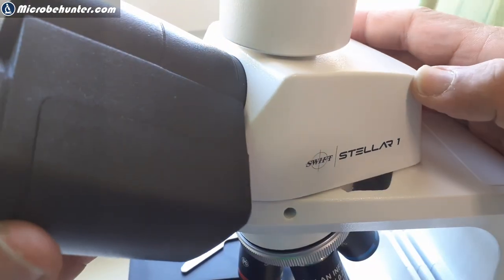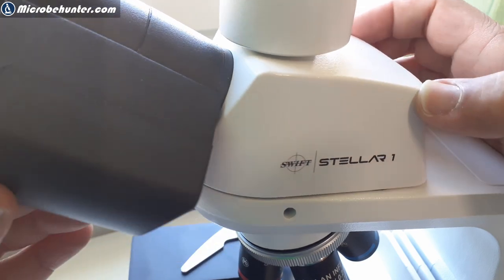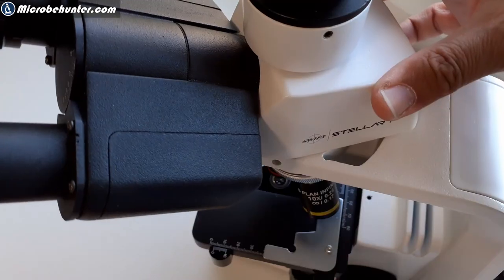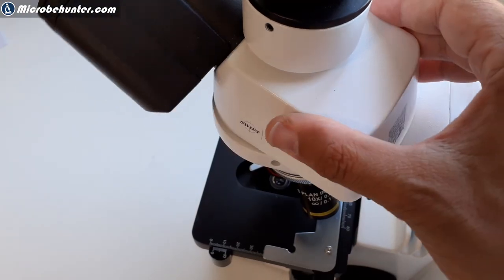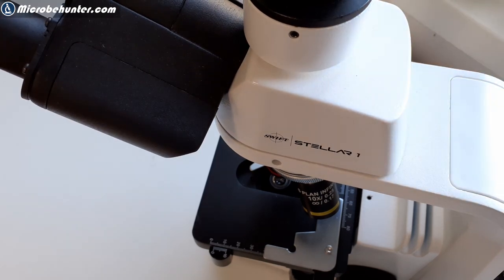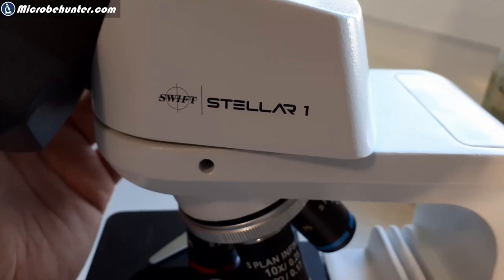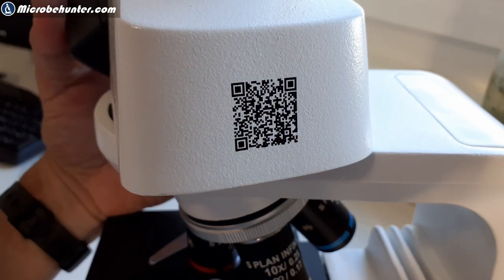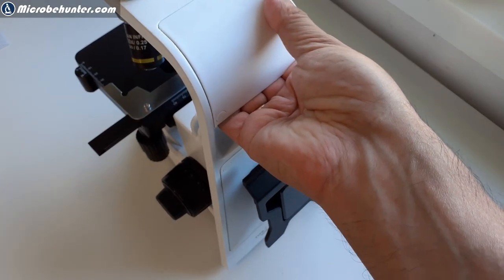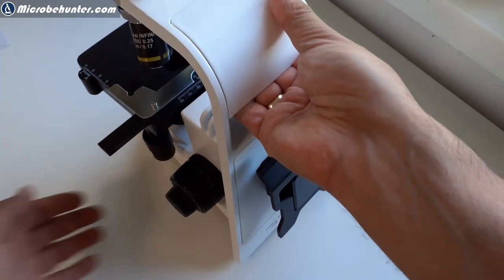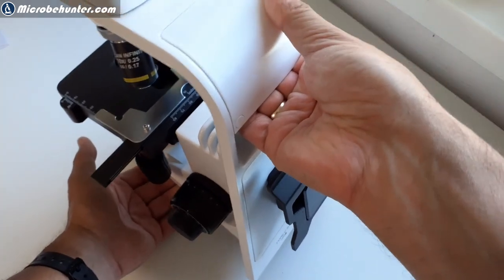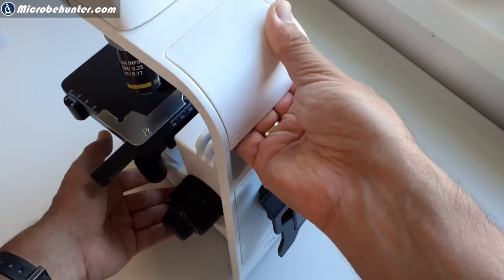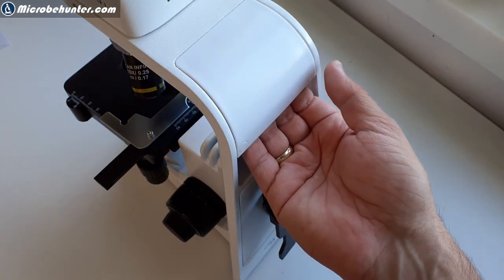This is the head. It can be moved back and forth. It goes very smoothly. That's quite well made, I would say. I would say even better than in many other microscopes of a comparable price. And here, again, we have a closer look. And here, there is a QR code. And if you take a picture of this, then it connects you to online and you can get some information about the microscope and its use. There is also a grip, so it can be carried as well, the microscope. So that's also quite a nice, convenient feature.